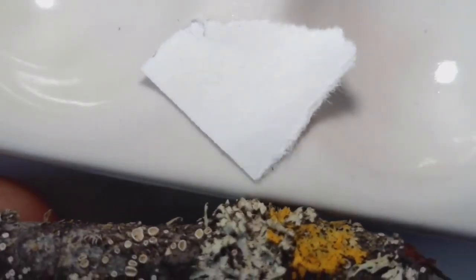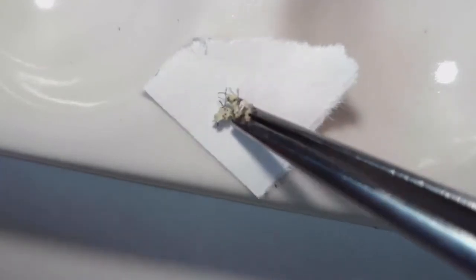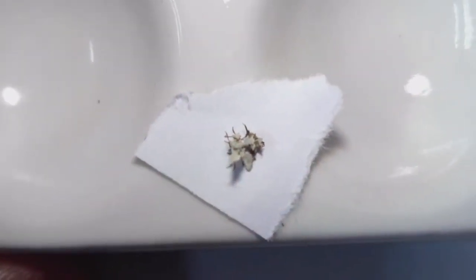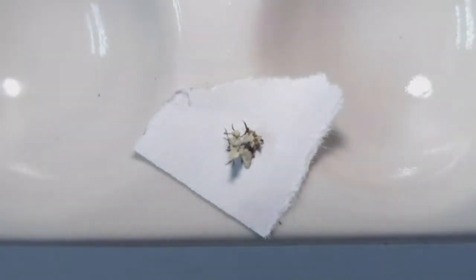I'm going to take off a small piece of Physcia, so this kind of lighter colored lichen right here. I'm going to take off a few small pieces of that and place that on the piece of paper. You can really see those cilia sticking out, characteristic of Physcia. And then we're going to do the K-test.